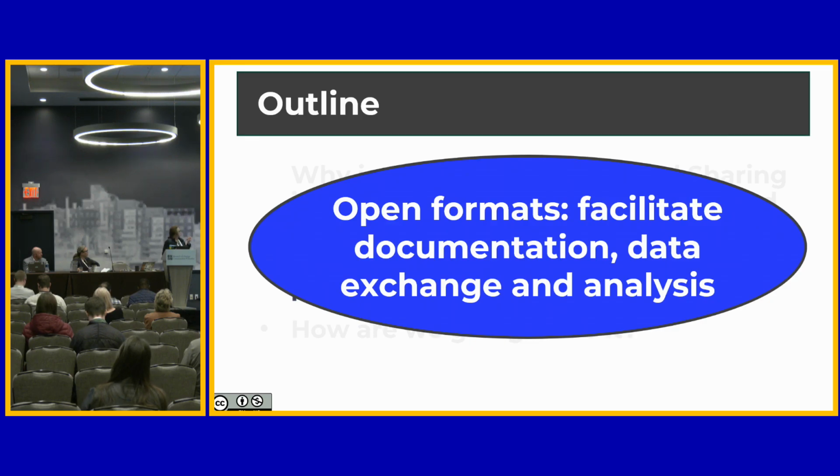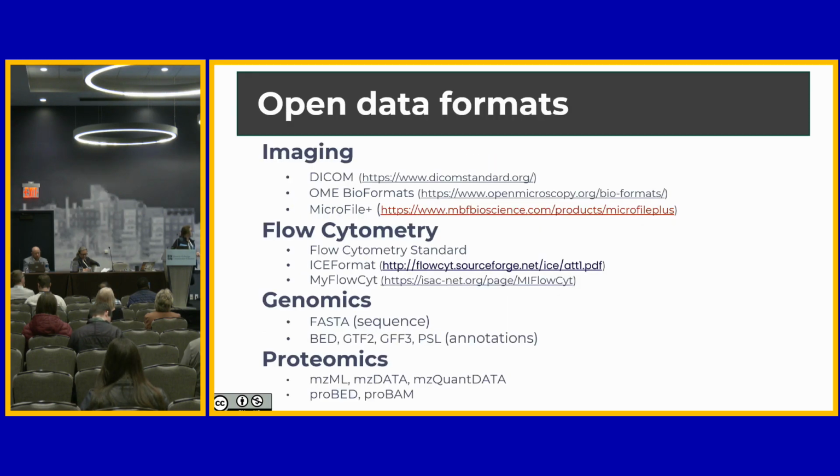So open formats is one of the first things I told you about. It facilitates the data exchange and analysis. It facilitates keeping track of the documentation, exchanging the data and the analysis, so that we can give the people that will do the analysis, whether a colleague in our lab or somebody in another lab, the ability to access the data in a way that is easy for them. Actually, they may not have to develop the readers anymore because they are available, because the formats are open.